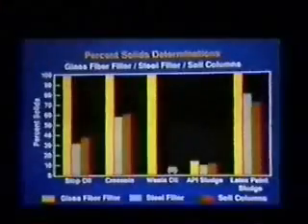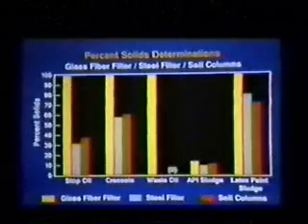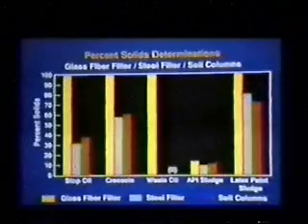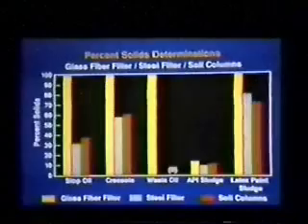Once we had developed the modified method and were satisfied with the liquid-solid separations we were getting with the new stainless steel filter, we felt it necessary to evaluate the full modified method. To do this, we conducted the modified method 1311 in triplicate on the same wastes that we used for the soil column experiments. By comparing the waste constituents released into the filtrate and extract of the modified method with those released into the soil in the soil column experiments, we measured the accuracy of the new procedure.